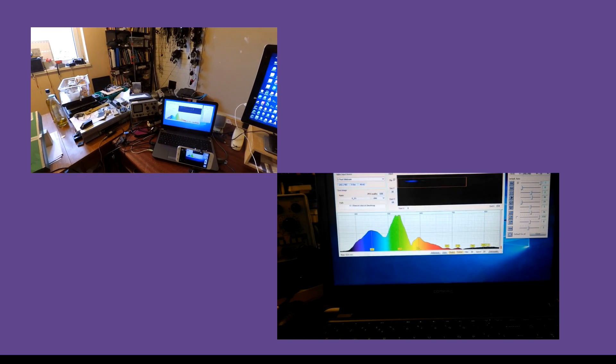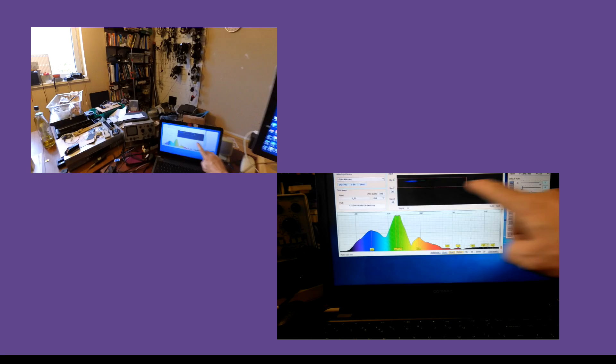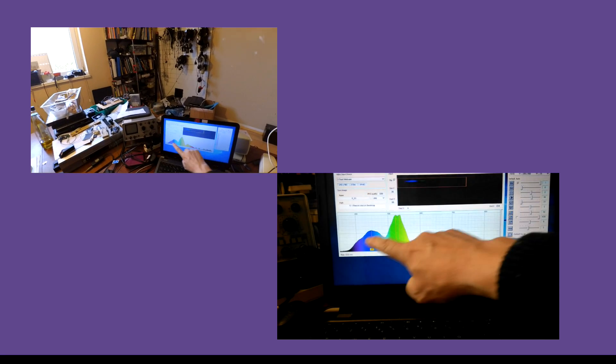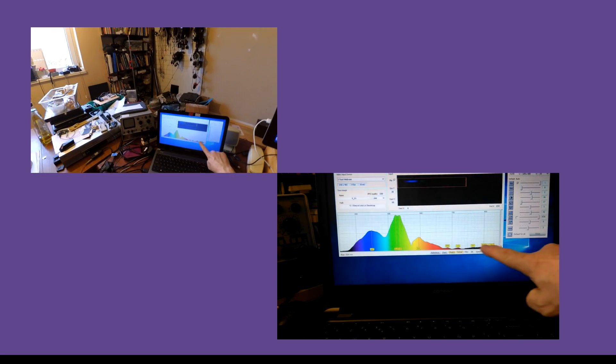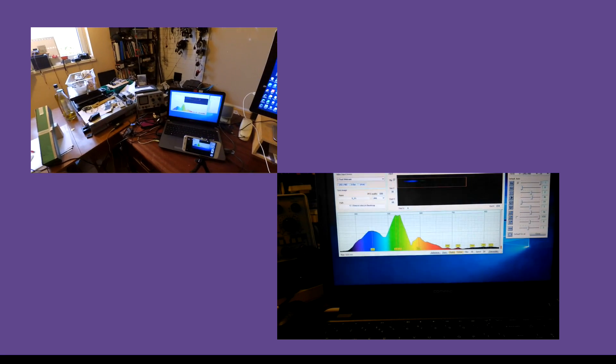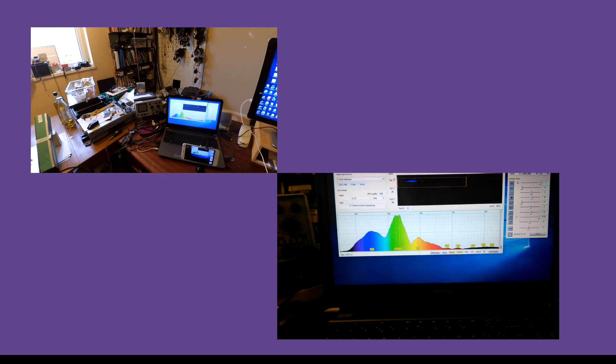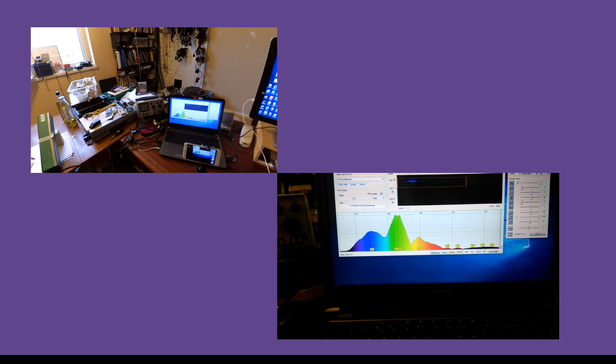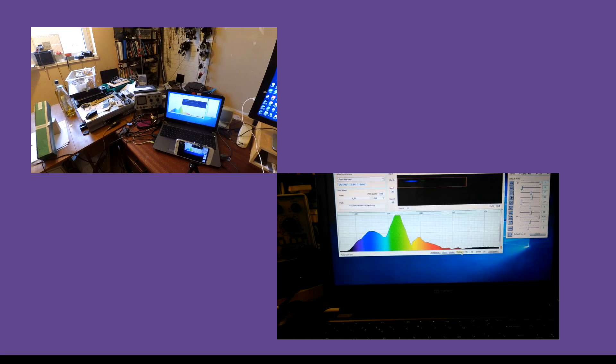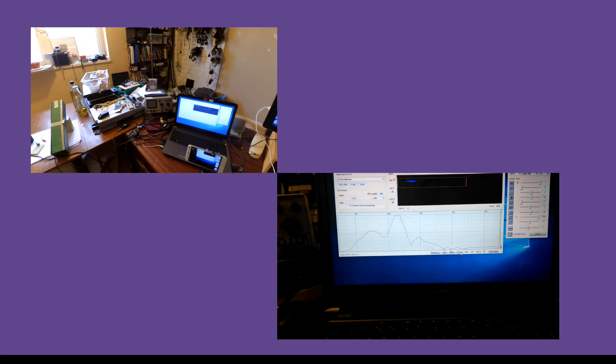And you see the spectrum on the screen, and you see a histogram showing the distribution of brightness across the screen. And this thing's got some bells and whistles on. You can have the naked curve.